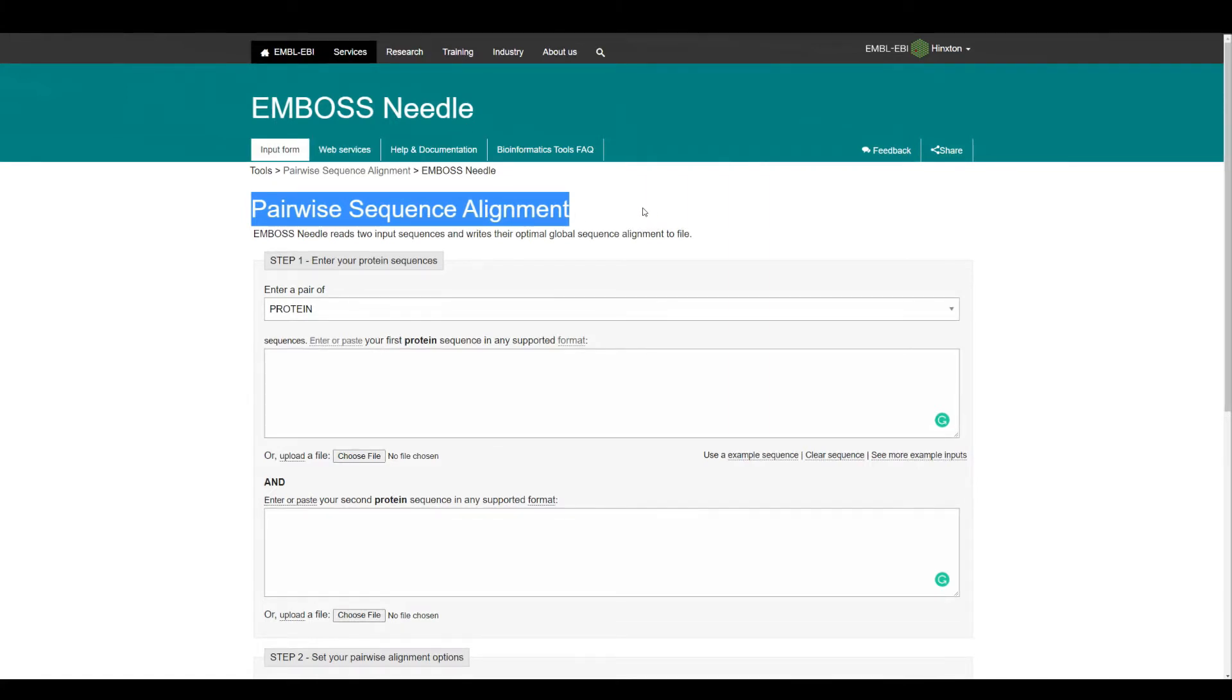I've been using this software for my sequence alignment projects and I like this software. I'm going to show you how you can do the pairwise sequence alignment of your protein sequences using this specific software.